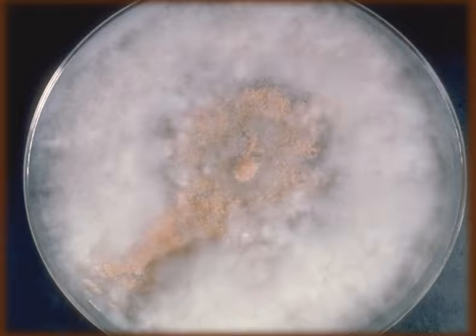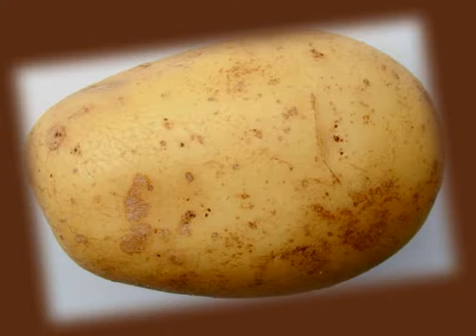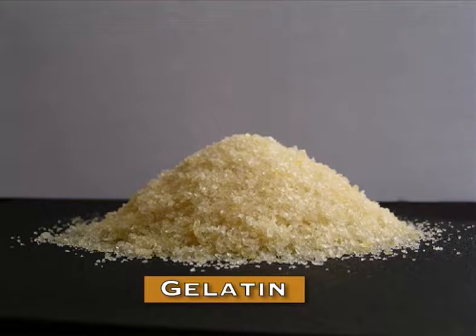However, potato could not be used for the growth of a wide number of bacteria. It is generally known that any culture medium will always be favored when it supports the growth of a wide variety of microorganisms. So the potato could not be used as a source for many microbes. It was replaced with gelatin. Gelatin is an animal tissue extract, and it was used as a solidifying agent in bacteriological media. However, in due course of time, gelatin was replaced with agar.